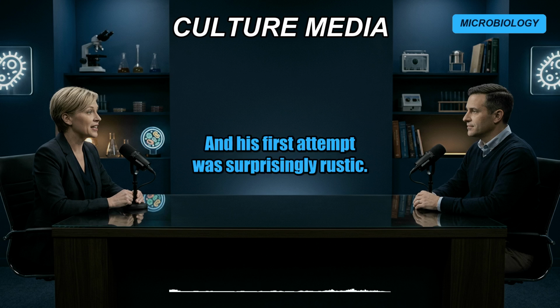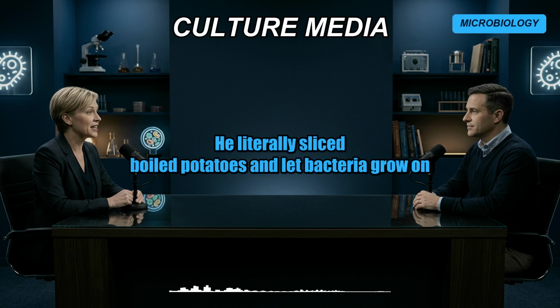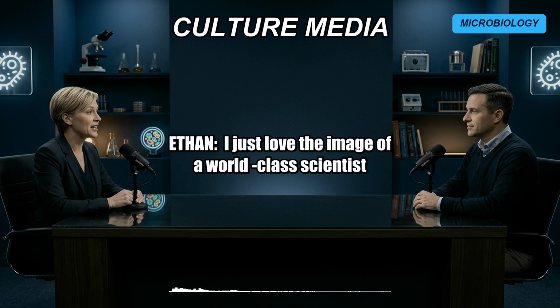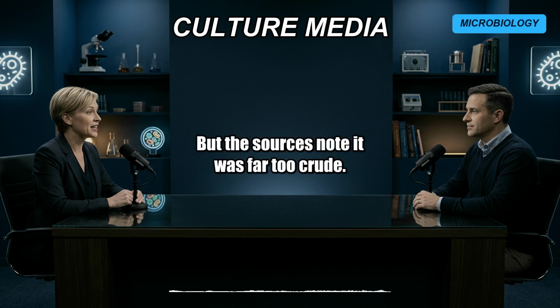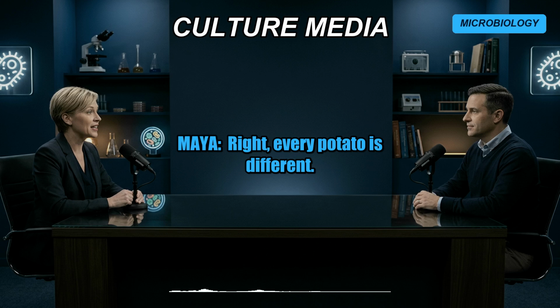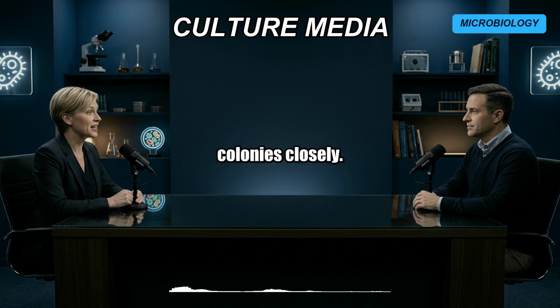And his first attempt was surprisingly rustic. Oh, the potato. Yes, the potato. He literally sliced boiled potatoes and let bacteria grow on the moist cut surface. I just love the image of a world-class scientist staring intensely at a moldy potato. It's very glamorous science, right? So glamorous. But the sources note it was far too crude. I mean, you couldn't standardize a potato, obviously. Right. Every potato is different. And it certainly wasn't transparent enough to inspect the bacterial colonies closely.